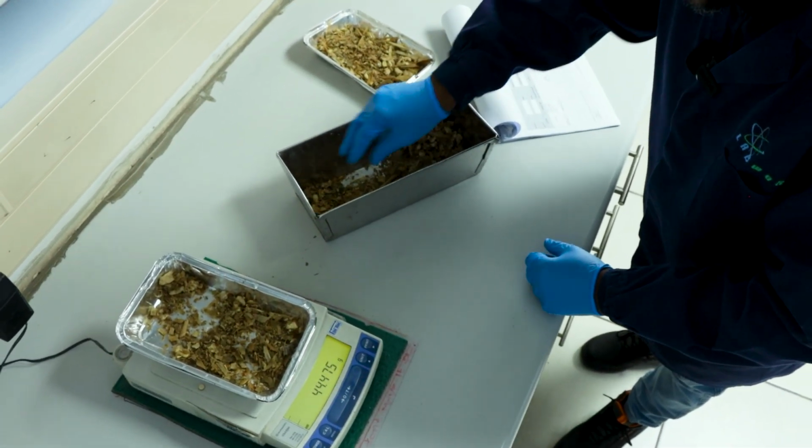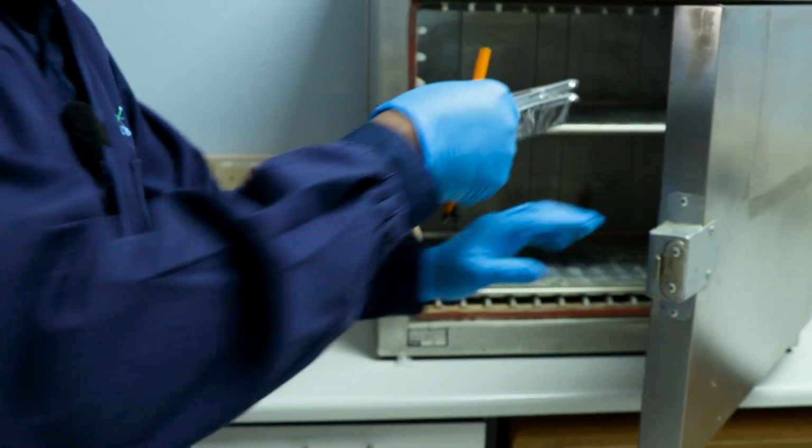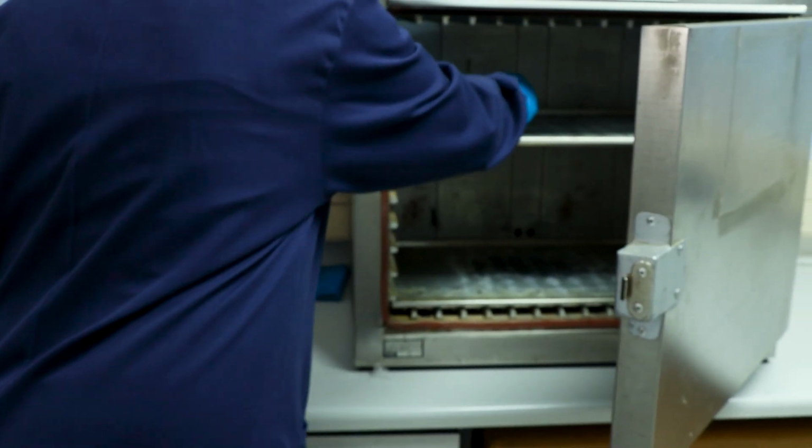Our moistures normally take 3 hours at a high temperature, and then our shorter moisture, which is 72 hours in a 50 degrees oven, is for a wet sample.